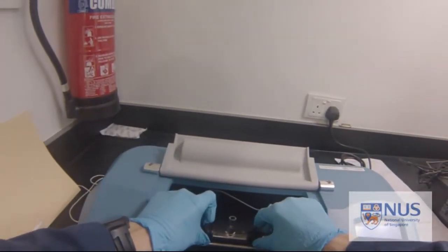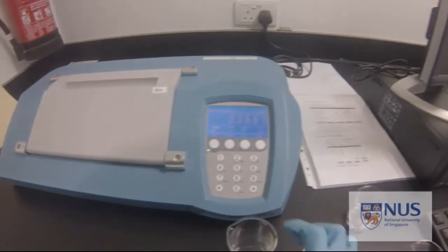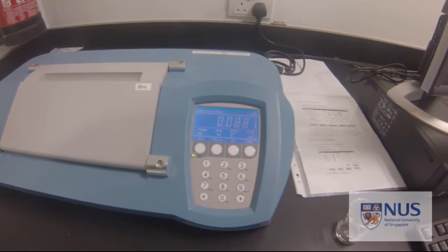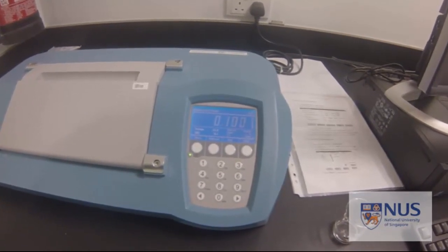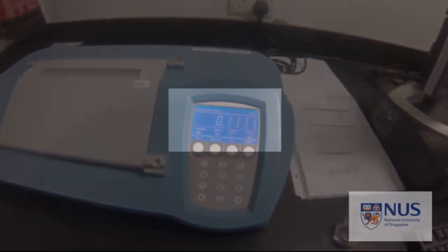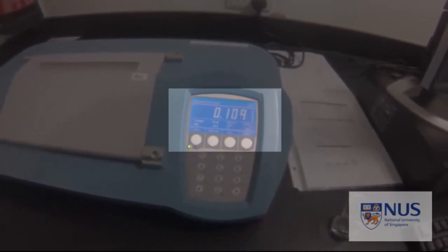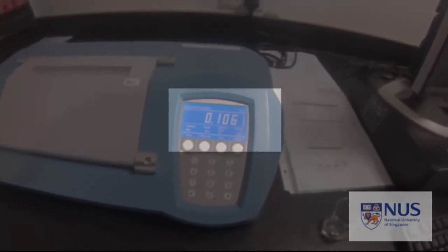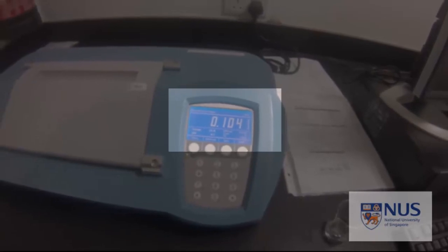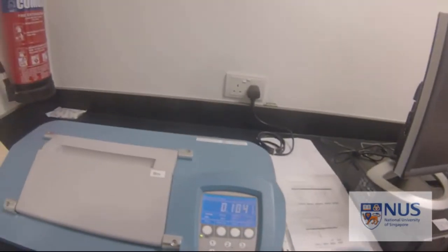Make sure it sits nicely and doesn't shiver. The reading is 0.111 and it's going down a bit — hold your breath, it should stagnate. Now we have 0.104. That's the final result. Record it down.